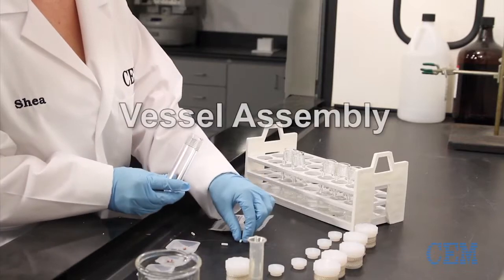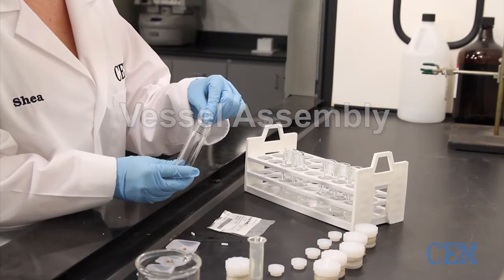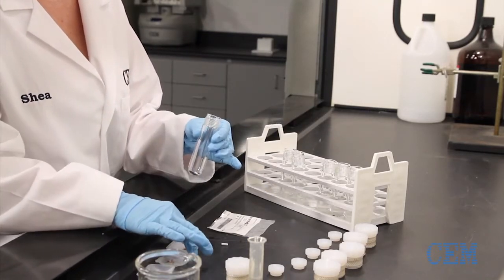To assemble the Glasschem vessel, first place a stir bar in the vessel and then add reagents and solvent.